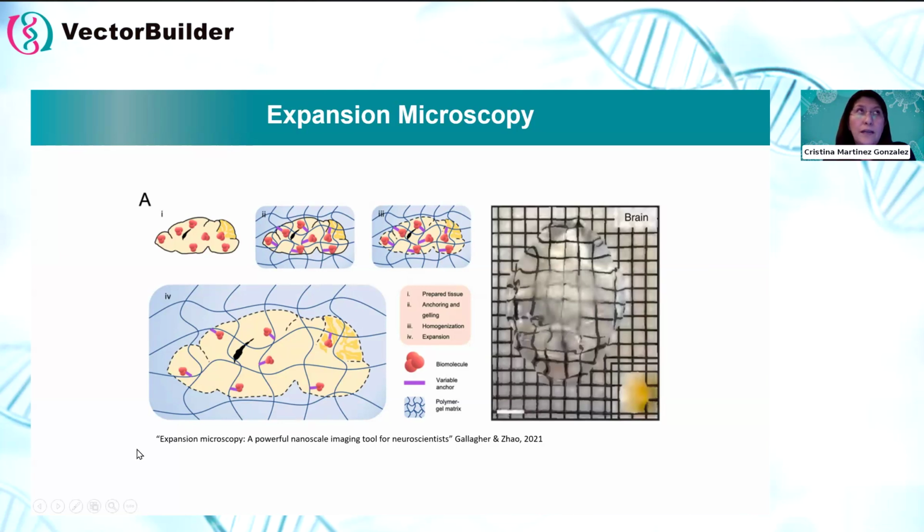So you can artificially increase your resolution to nearly, in some cases, electron microscopy. So this approach can be very helpful for some people. If you're especially dealing with tissue slices, organoids, etc., I would recommend this type of approach. Not for a whole brain, but for some smaller structures, it can be very valuable.